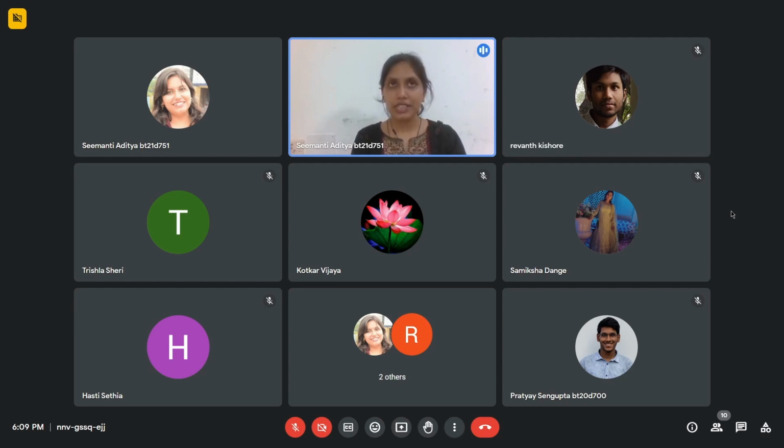Refrigerators inside the cell culture room should be placed in such a way that they do not block the entrance, and the door can be opened properly. There are also certain regulations about where we should not place the hood, refrigerator and incubator, because those three things get opened. They should not be placed in a direction where the window is.